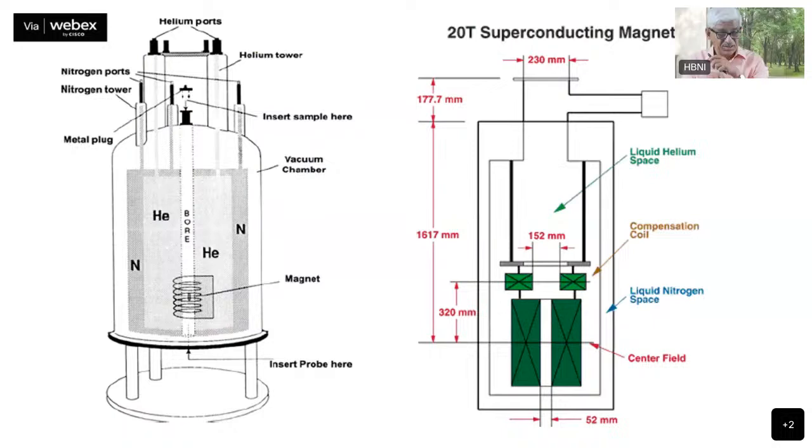We discussed about the magnet, superconducting magnet. Special property of superconductivity is exploited here. Superconductivity means the resistance is zero. Therefore, once the current is going inside a coil, it will persist. It's a persistent current. It continues to go. Therefore, the magnetic field generated is absolutely stable. And you can generate very high currents in the coils because you get a large number of turns.